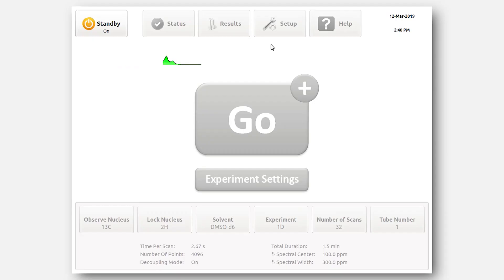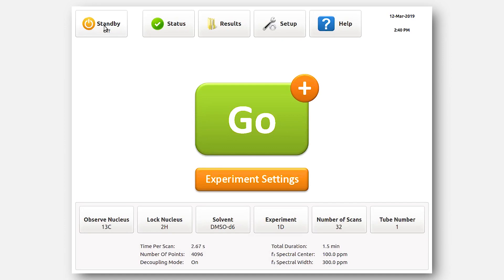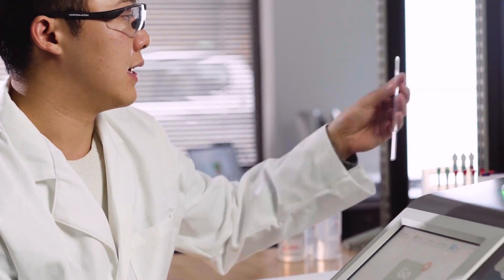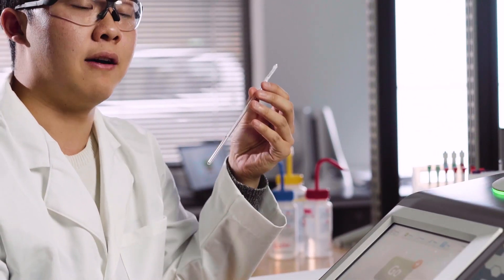To run a carbon experiment, first we have to take the spectrometer out of standby mode. When I'm out of the lab or out on a coffee run, usually I'll have the spectrometer on standby. This allows the spectrometer to shim regularly so that when I come back into the lab, I can start experiments without prior shimming. Now we take the sample and we put it into the spectrometer. In this case, we are using a 4 molar solution of diethyl phthalate in DMSO.